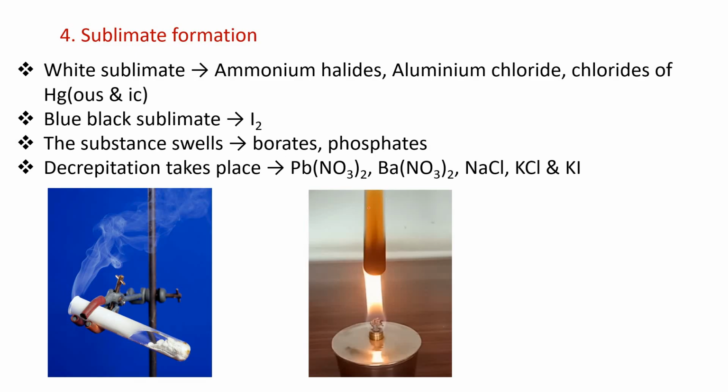And if decrepitation takes place, decrepitation means that while heating, some cracking sounds will be developed. For example, it is most important for lead nitrate. When you heat lead nitrate, nitrogen dioxide gas, that is brown vapors, and oxygen gas are formed, lead oxide is formed, and it burns with a cracking sound, that is decrepitation.